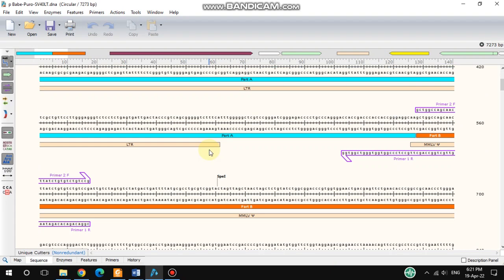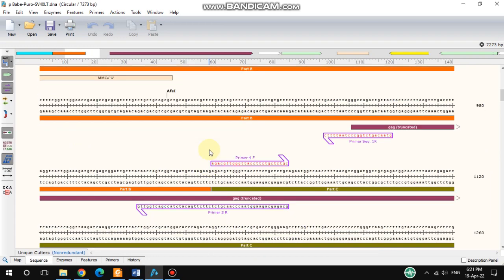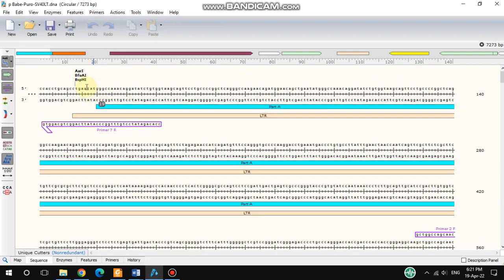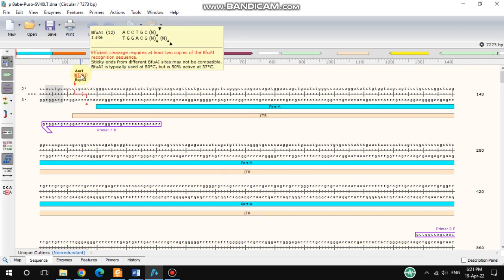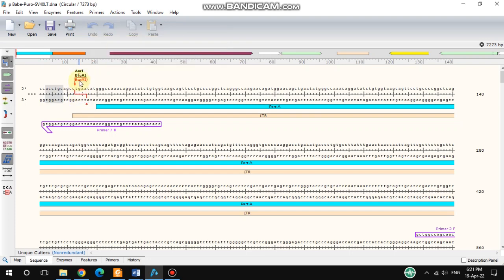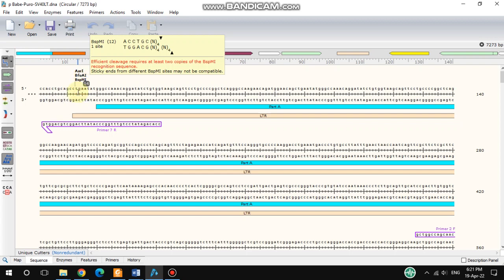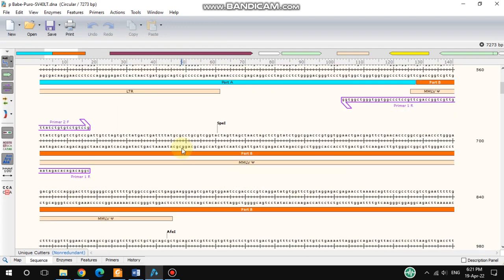Once added, the restriction enzyme sites are shown on the sequence. If you take your cursor over a site, it shows information about the restriction enzyme and also the cutting manner. The red part you see indicates a sticky end cut.